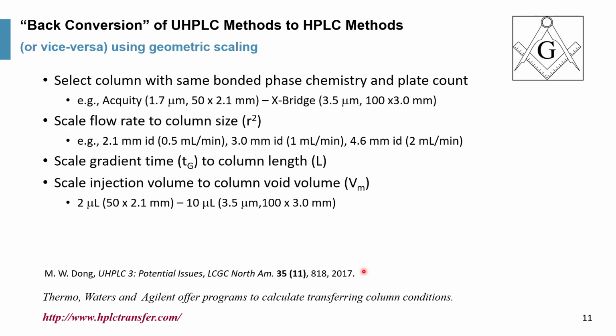Also, one can find an actual conversion program from Thermo Fisher Scientific, Waters, and Agilent websites, or from this website called HPLCtransfer.com from the University of Geneva by David Guillaume. This is an Excel spreadsheet, and it's very useful.